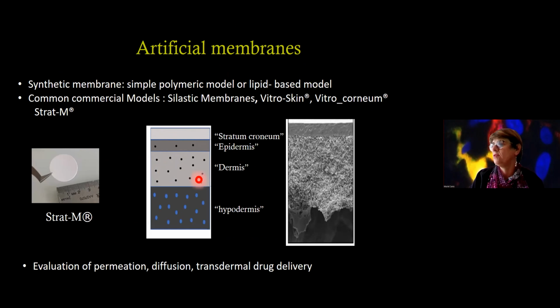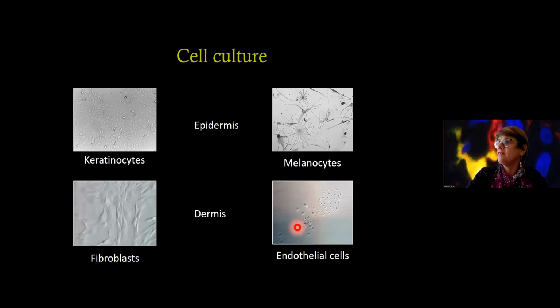But in this model, there are no cells, which are important for the behavior of different actives which will be integrated in the skin, in the cells. So to build a model of skin equivalent, you need cells. So I show you here some pictures of cells.